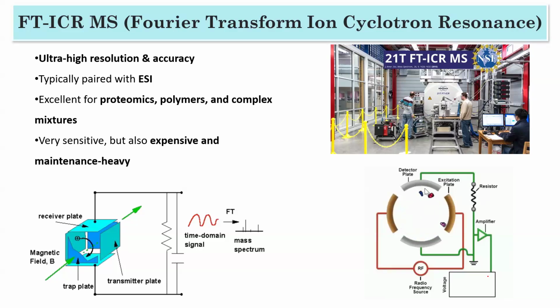Okay, so different mass will move differently. Okay, yeah, Anisa, we will talk about tandem mass spectrometry.